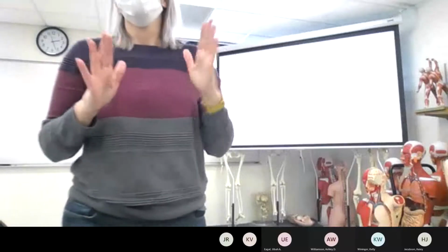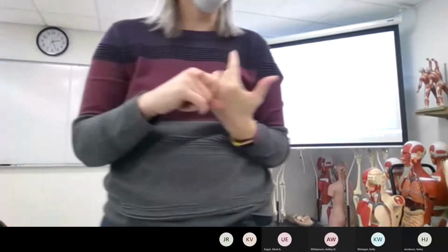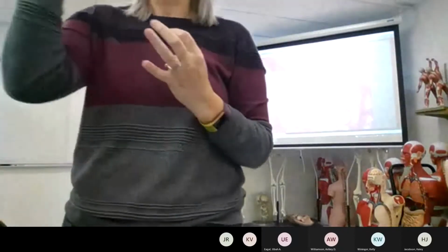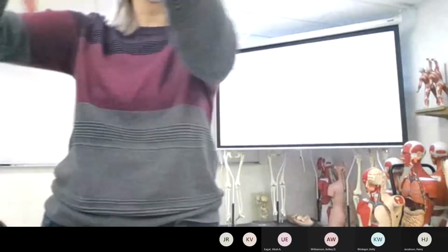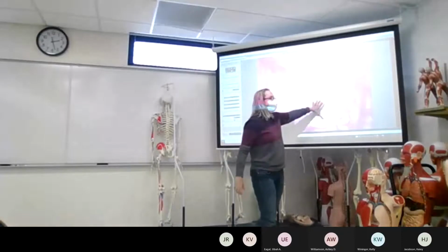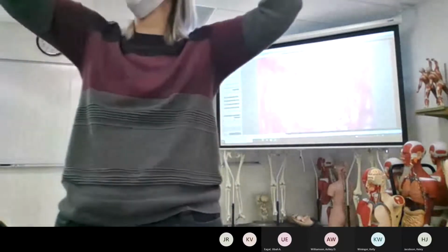All right. You would not probably be able to tell me what's collagen fiber versus elastin fibers, but you know the cells in here are fibroblasts, fibrocytes, mesenchymal stem cells. There can be adipocytes. There can be any and all of the white blood cells. The fibroblasts or fibrocytes are there to lay down collagen, elastin, and reticular fiber proteins. Okay? And because there is open space, there's room for capillaries.